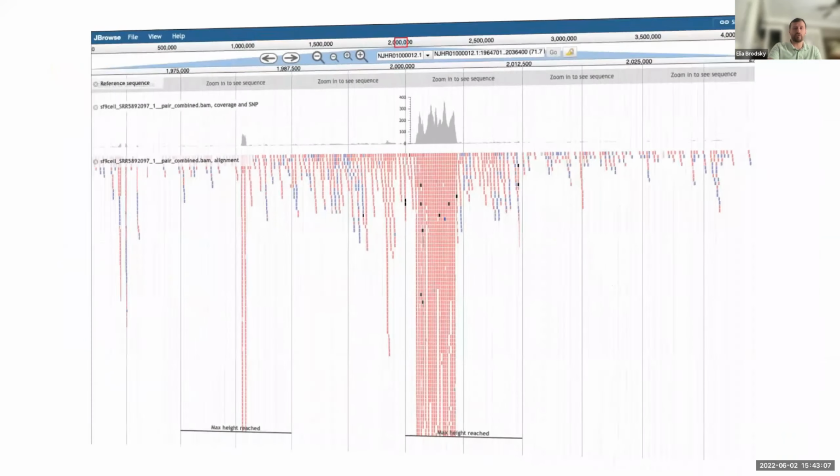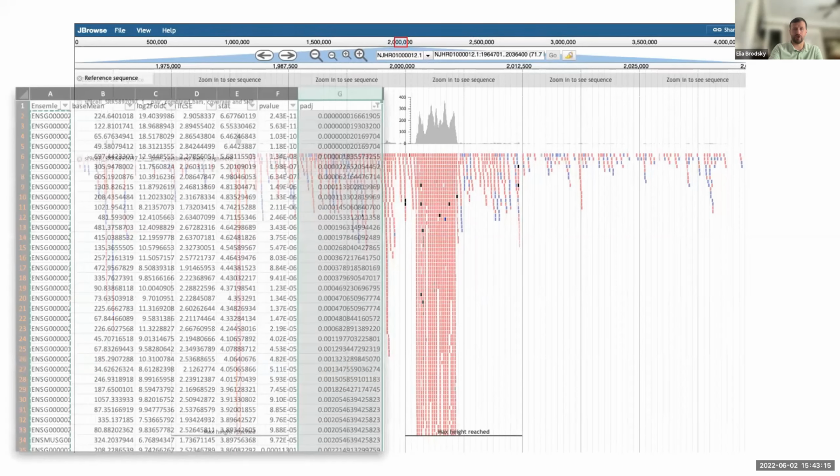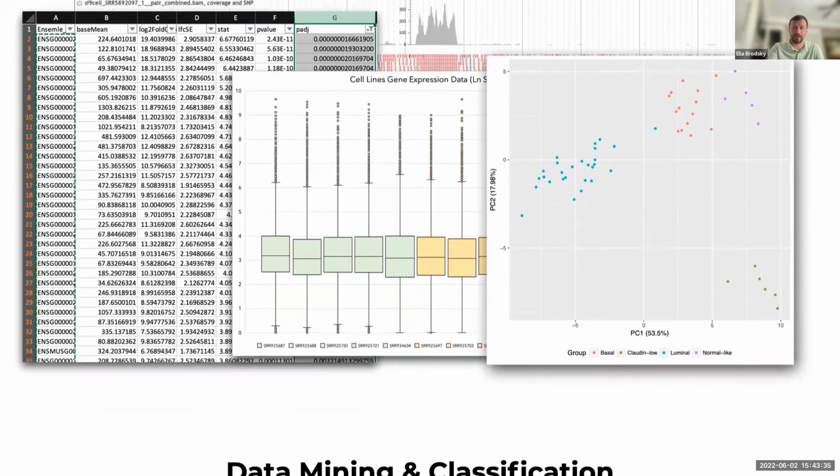Now, to do that, we will have to cover all of the steps from the basic alignment, as you see here, with the reads aligned to the reference genome, to then quantification, analysis of variance, and understanding of whether it is the right approach to be able to compare multiple conditions, and how do we actually go about more complex data sets where instead of just two contrasts, you all of a sudden have many. How can you analyze that kind of data?